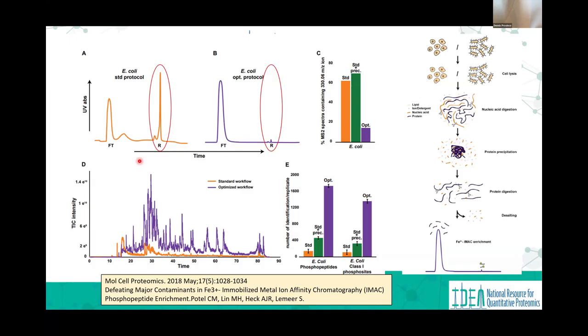And what they found was that DNA fragments, negatively charged, will quite happily bind, using coordination chemistry, to titanium and iron. But if they treated these samples with benzonase to digest the DNA down small enough, they didn't have the issue. And so they got much, much better results.